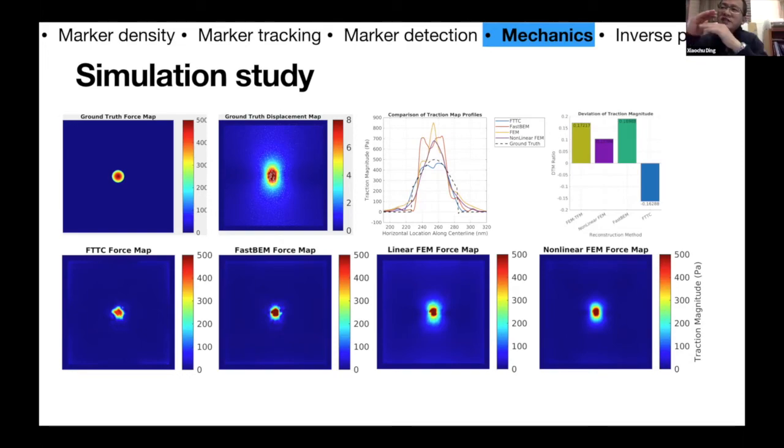Okay, so the key point is the cell can adhere to the substrate. Yes. We coat fibronectin or any ECM proteins on top of the gel. So you can also functionalize the gel surface with different molecules. For platelets, people use von Willebrand factor to activate them and encourage adhesion of these cells. People also use collagen, fibronectin, vitronectin, any other ECM proteins.